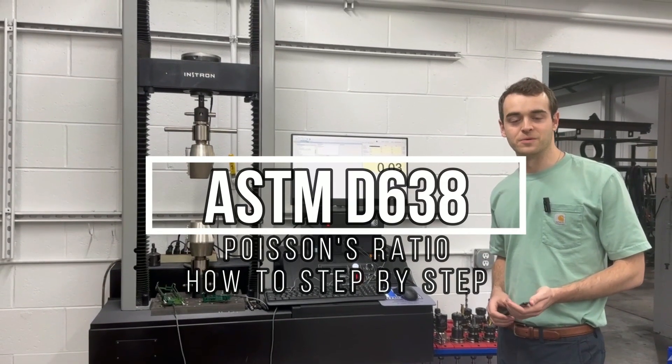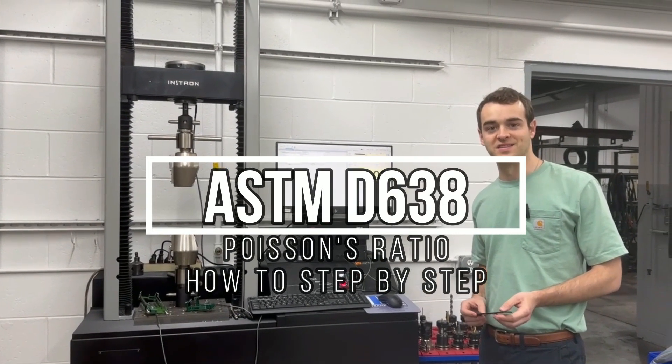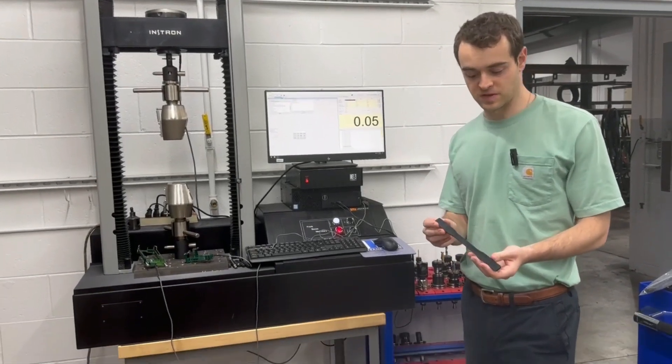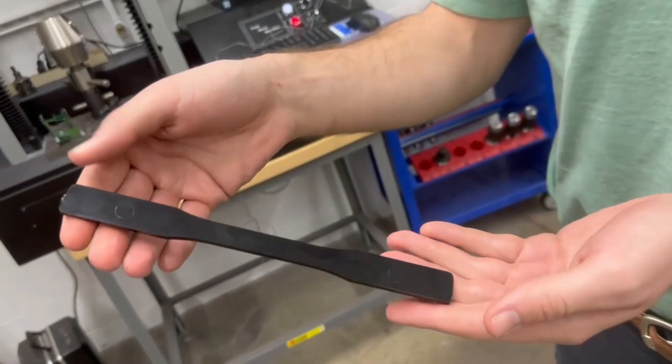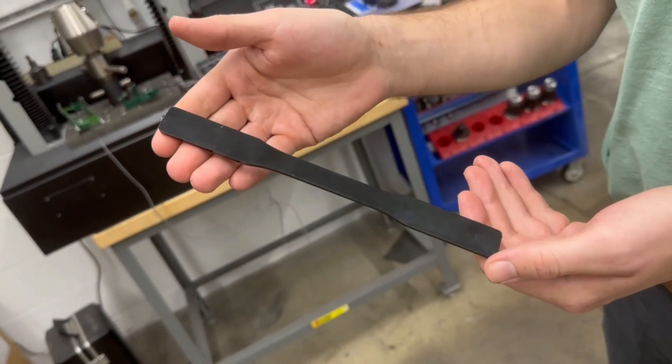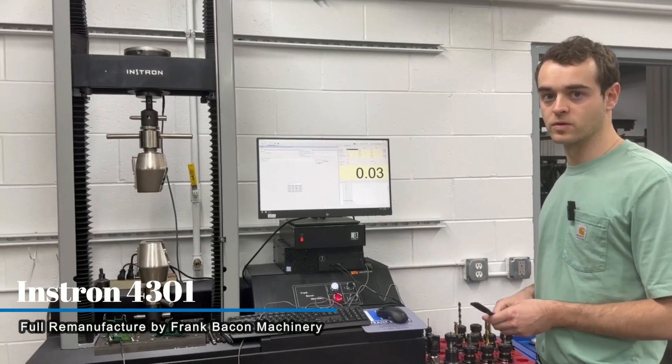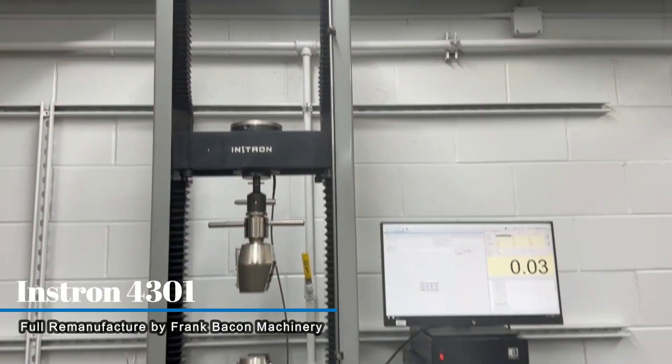Hey everyone, Chuck here with Frank Bacon Machinery. We're going to show you some ASTM D638 testing. These are some customer samples that have already been machined into a dog bone. We're going to be running this test today on one of our test systems — an Instron 4301 that we've done a retrofit and rebuild on.